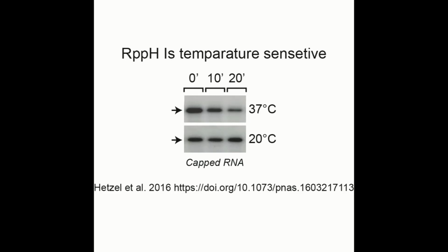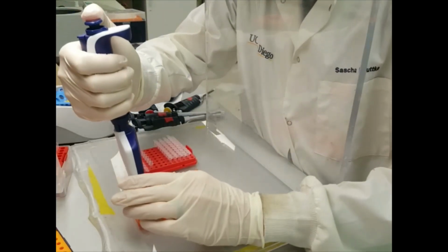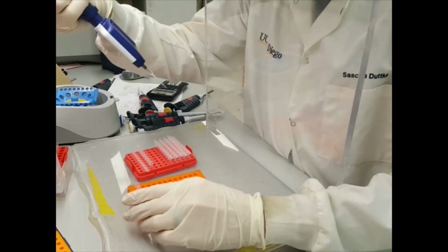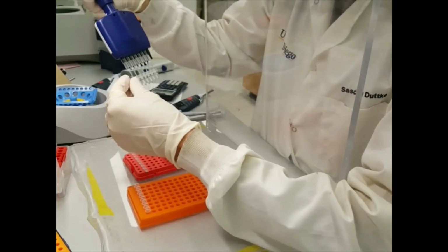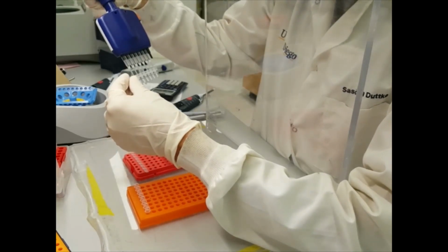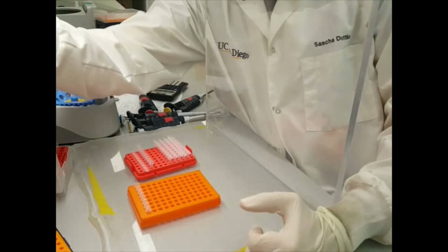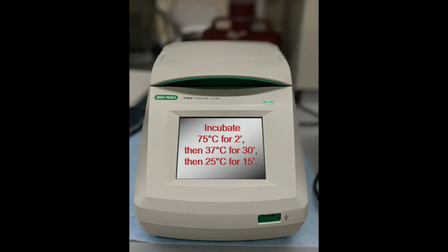Once your 3' adapter ligation is completed, you can add the RT primer. To do so, I recommend diluting the RT primer to about 5 micromolar and then using a multi-channel to add 1 microliters of RT primer for each sample. Hybridize the primer by heating the sample to 75 degrees for 2 minutes, followed by a 30 minutes incubation at 37 degrees and 15 minutes at 25 degrees.